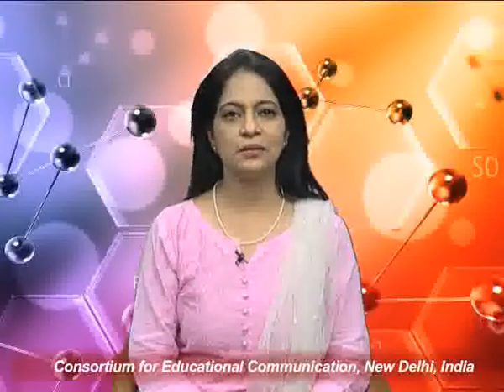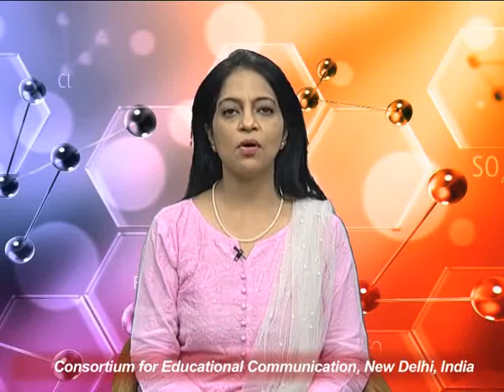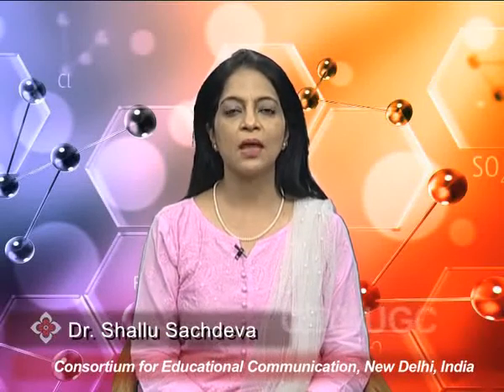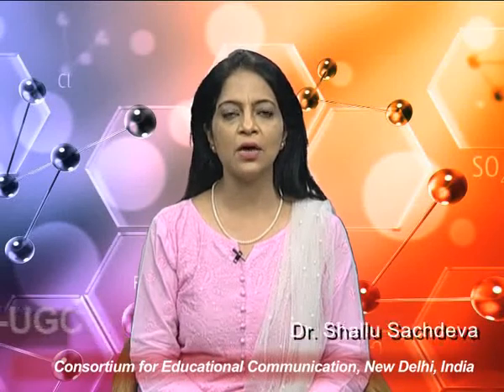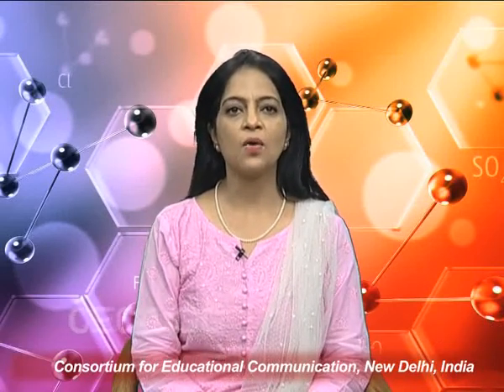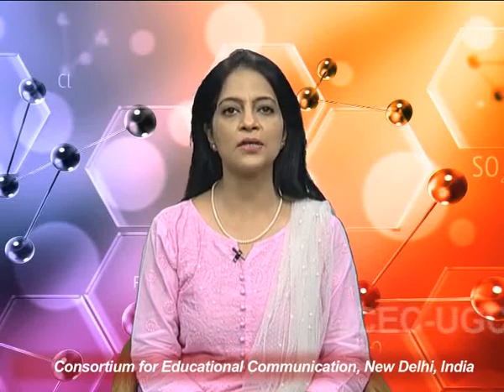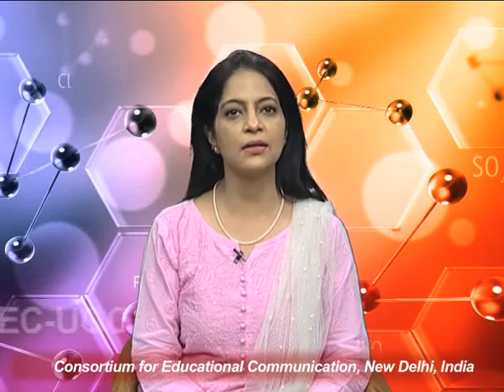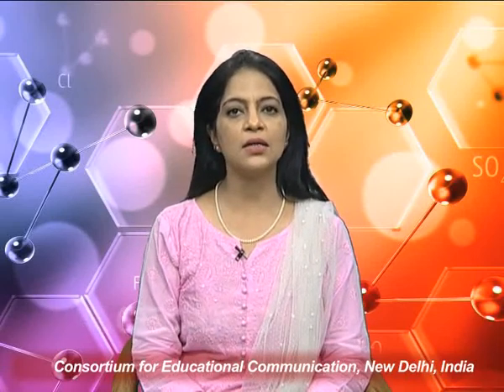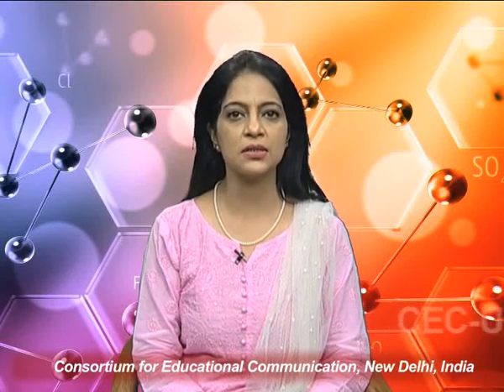Hello and welcome. In continuation with our previous lecture on complexometry, we have discussed masking or screening, which is required wherein some metals tend to interfere in complexometric titrations, that is, titrations with EDTA, and these metals have to be removed before the titration proceeds.